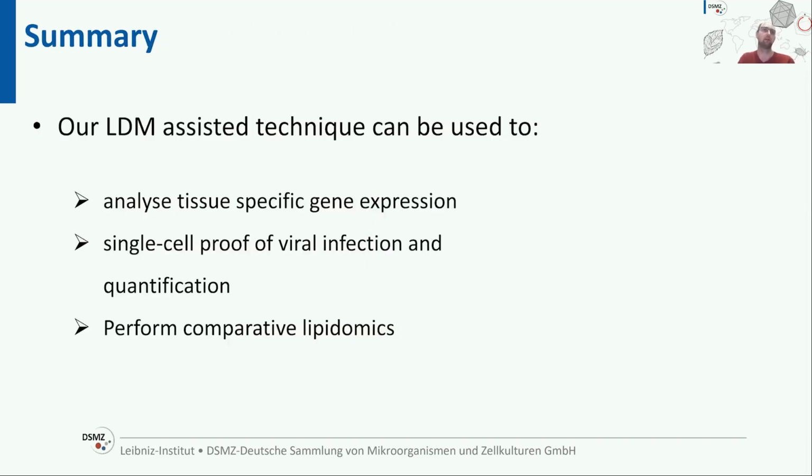We can use our LDM techniques to either analyze tissue-specific gene expression, or we can also probe single cells to see if they are infected by a virus, and can also quantify the amount of viral DNA. And additionally, in collaboration with our metabolomics facility, we can perform comparative lipidomics.